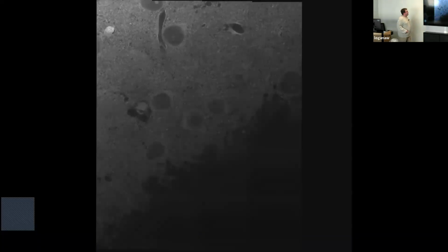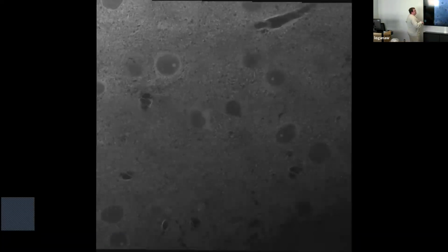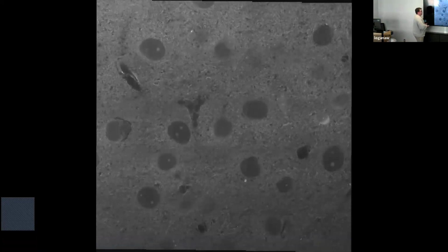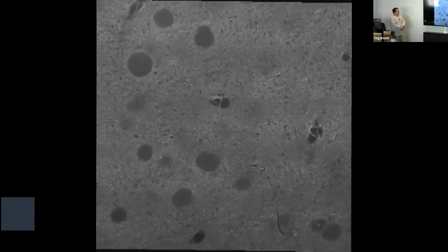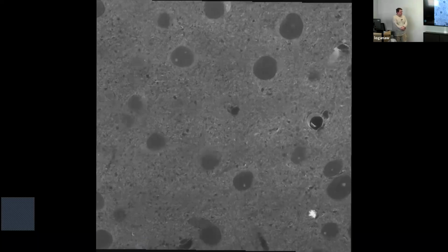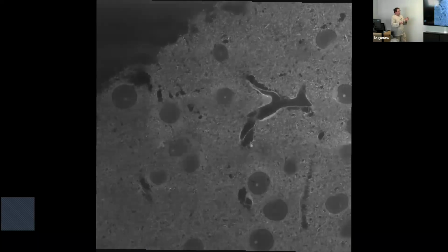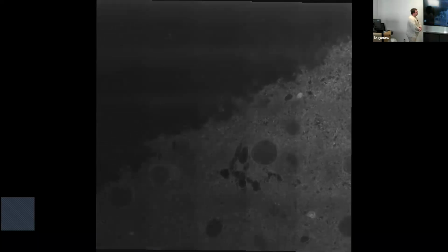This video decides to work. So this is what that data set looks like if you scan through Z. If you look at any one location, you can see these spindly things that go through the image. Those are your individual neurons. And there is work being done to train models built for analyzing electron microscopy data on this data. So the idea is that it could be a plausible replacement for electron microscopy in these types of experiments.